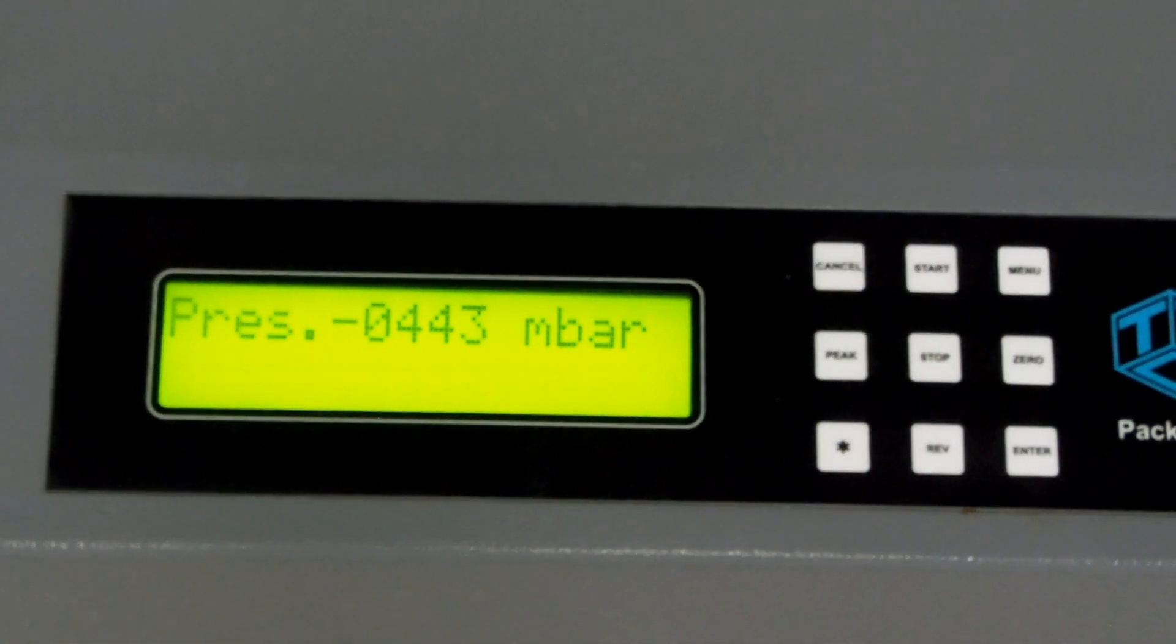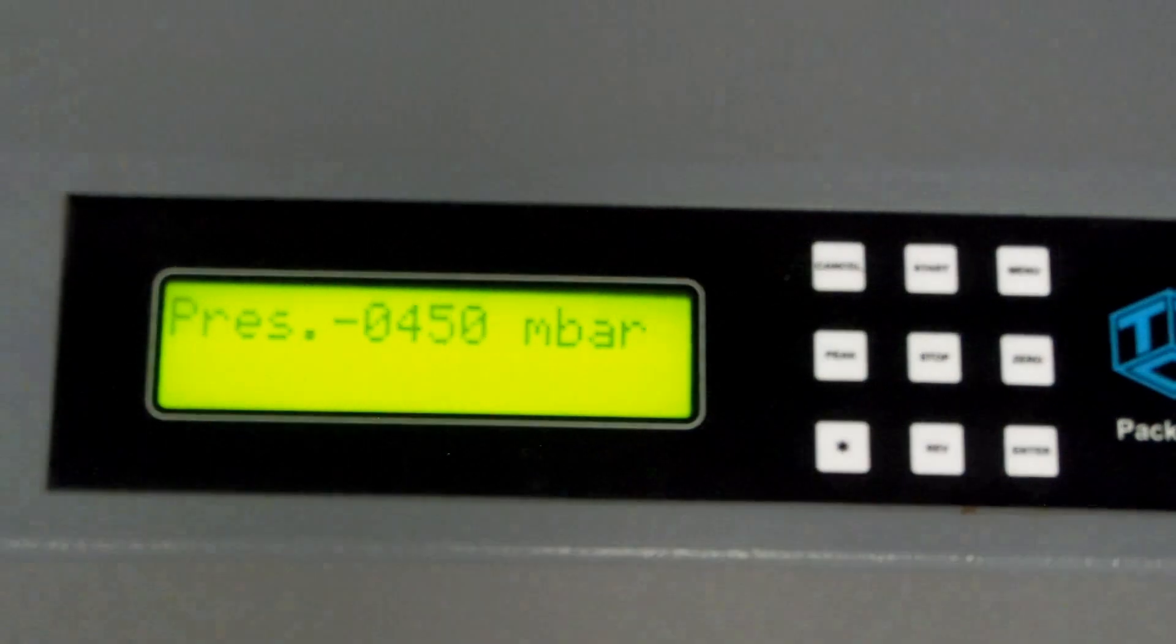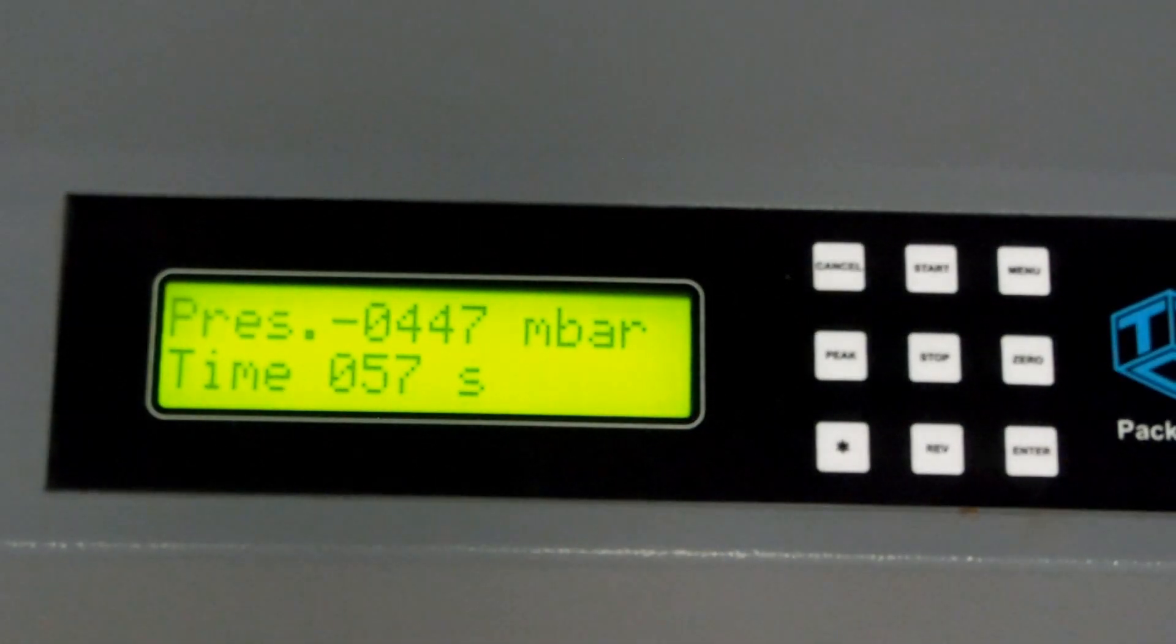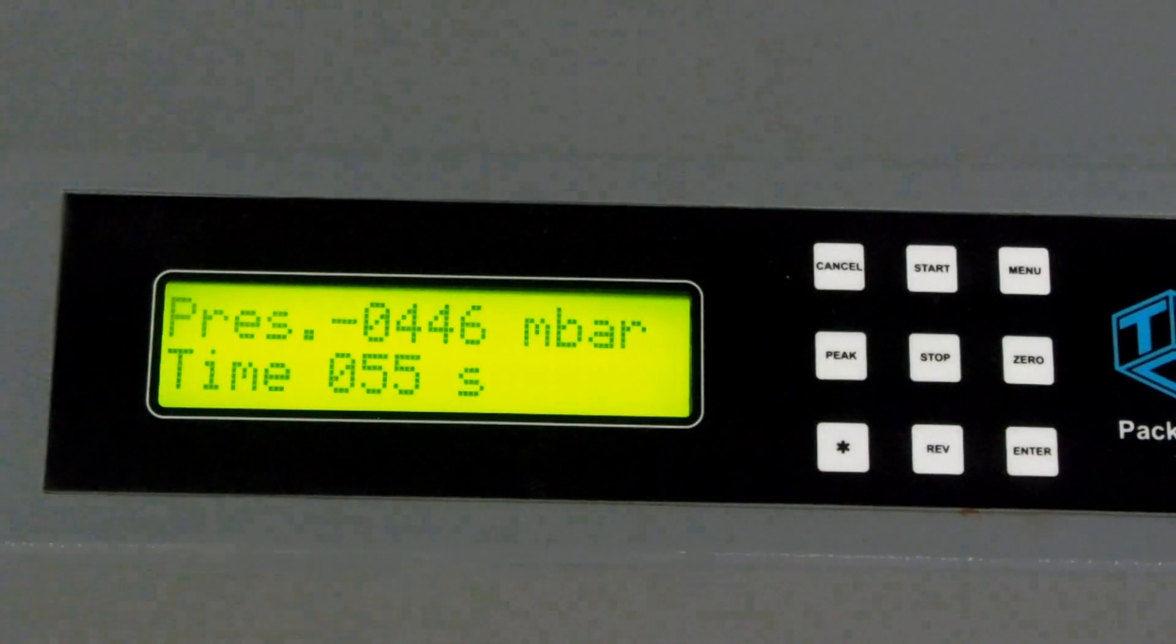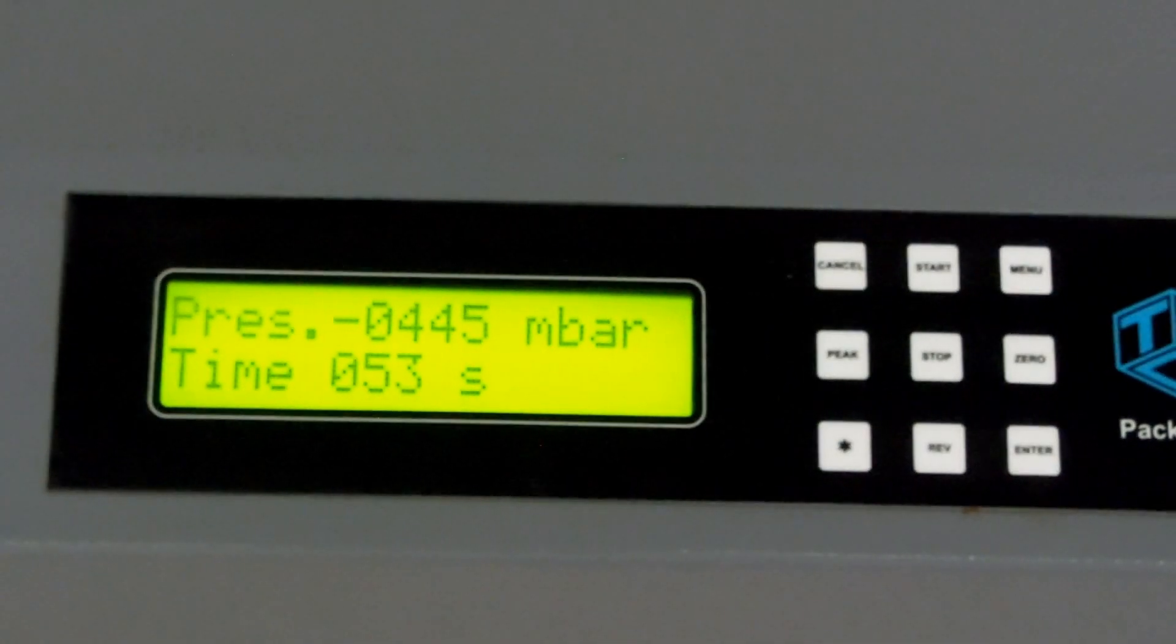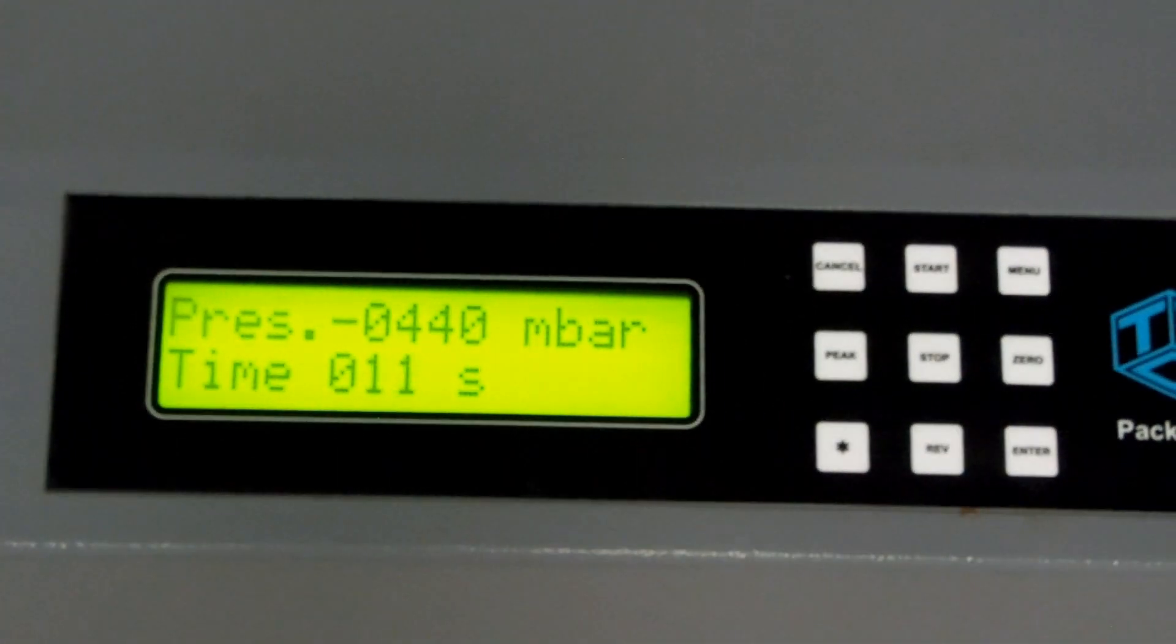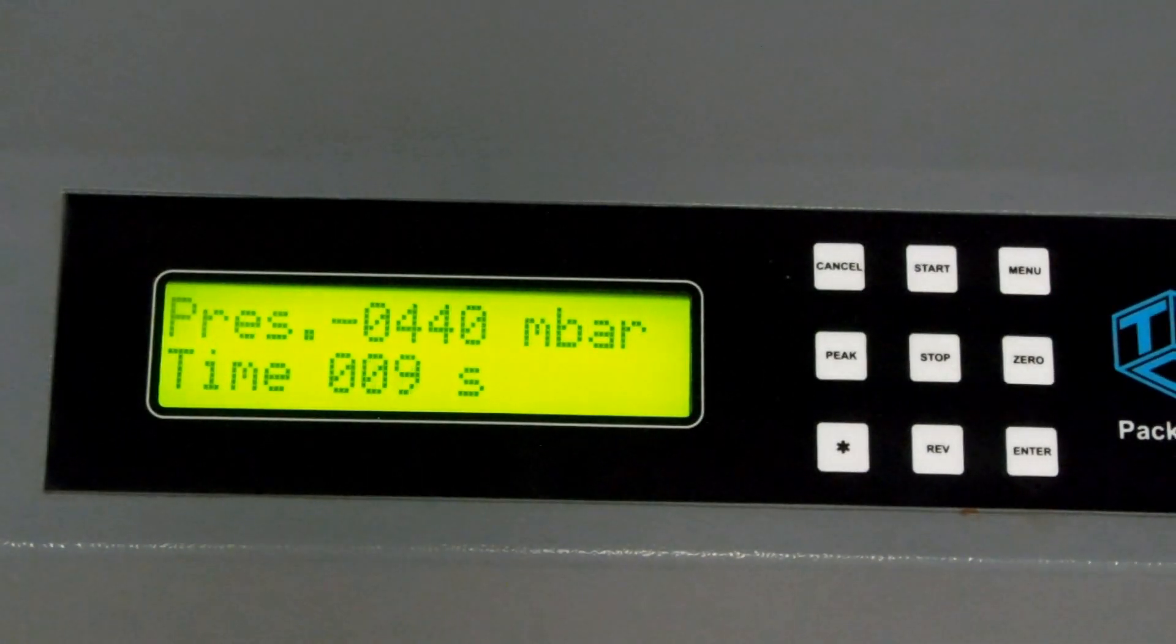As soon as the desired vacuum setpoint is achieved, the pump will stop and a countdown timer will start. You may notice a minor vacuum drop of up to five percent during this period, which is normal.